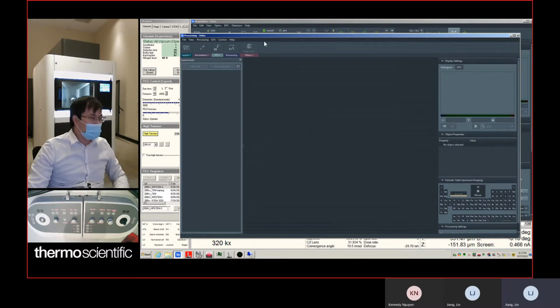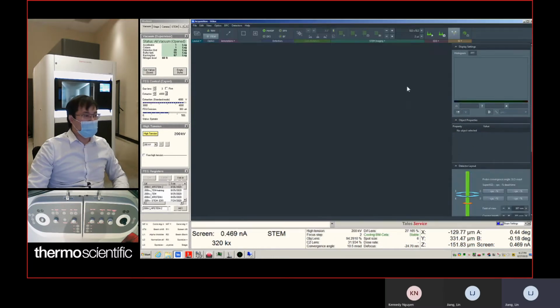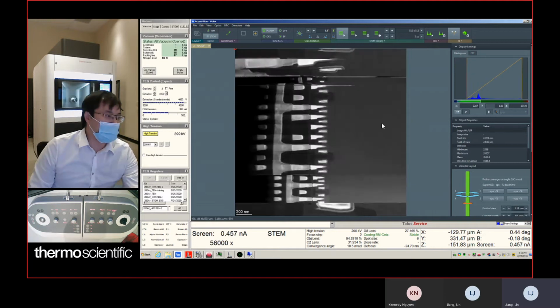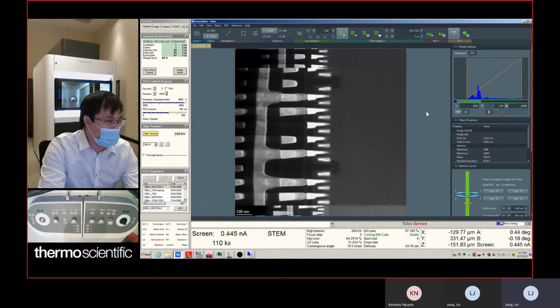Okay, so we're back. Because we took some data, it took the memory. Simply close and reopen it, and you're going to solve that issue.